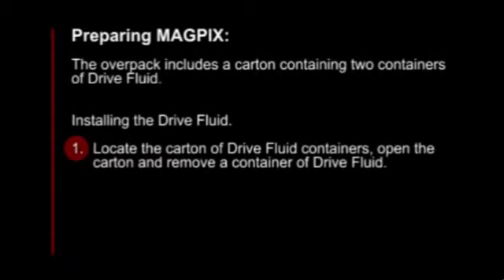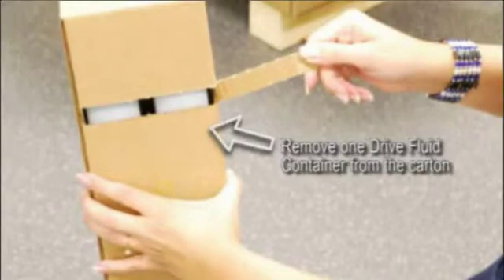The MagPix overpack also includes a carton containing two containers of Drive Fluid. To install the Drive Fluid, first, locate the carton of Drive Fluid containers.